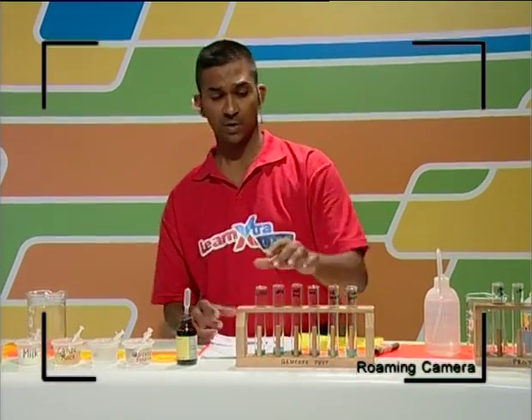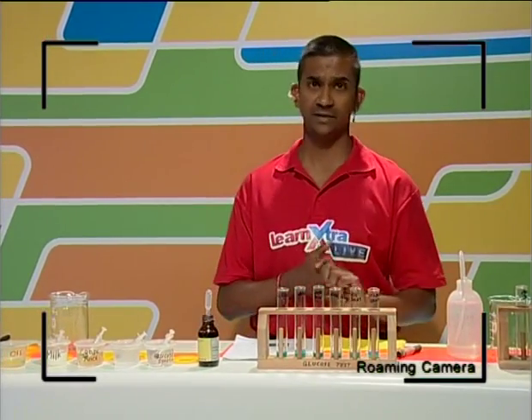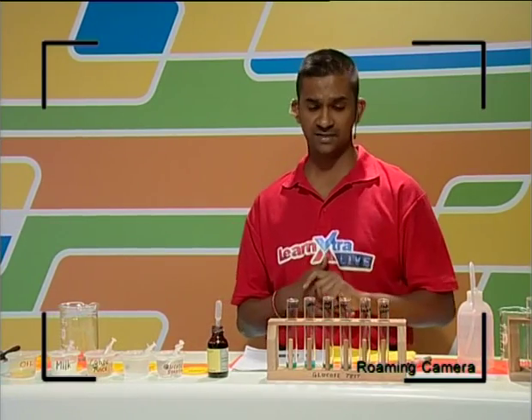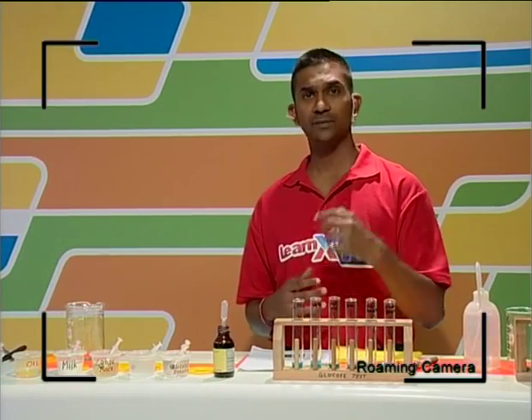But these test tubes would need to go into a water bath. And there's a reason why they go into a water bath, and that's important to understand. Remember that reactions are speeded up when we provide heat.